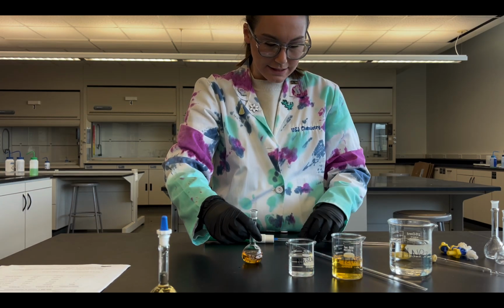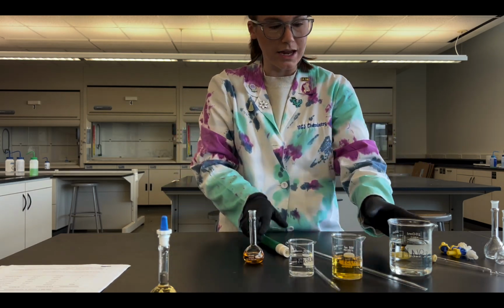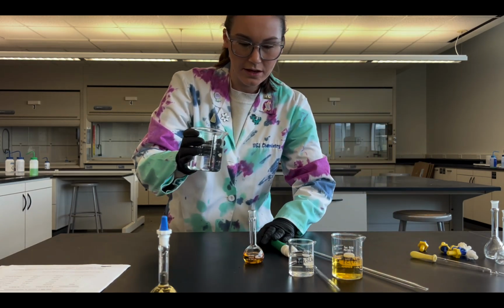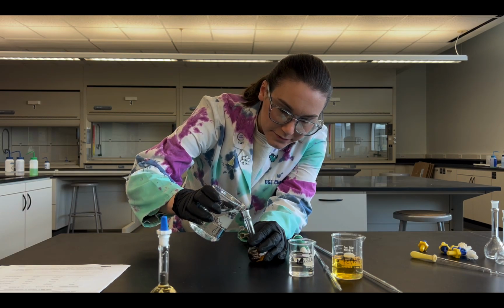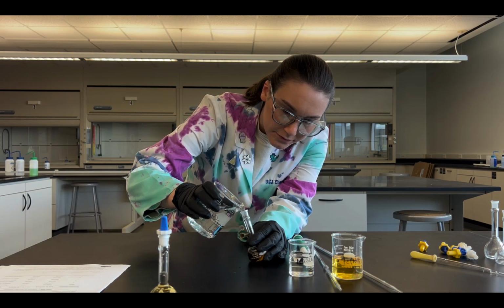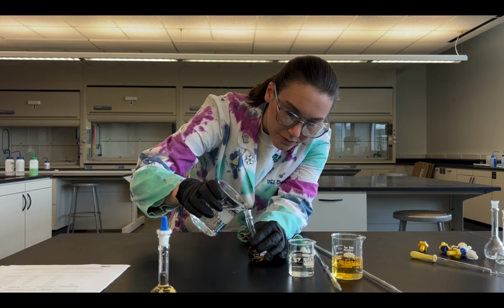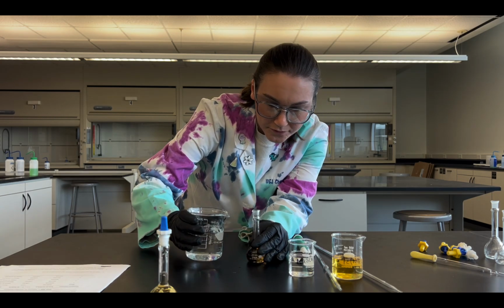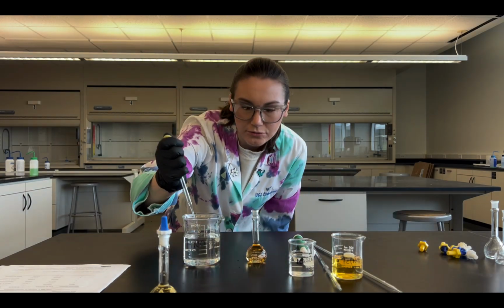So my last step to this is going to be filling the rest of the way with my nitric acid. So we'll do that here. And I'm going to use my pipette to fill the rest of the way. Oops.